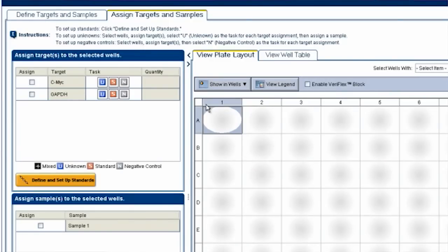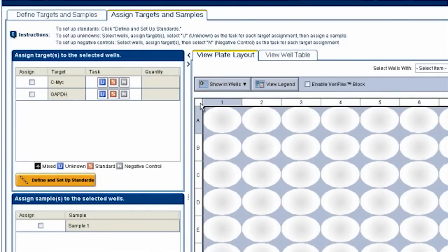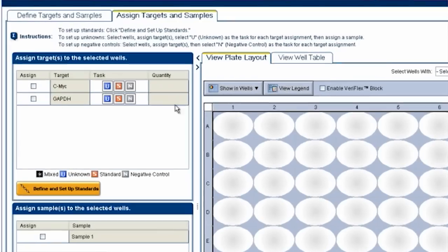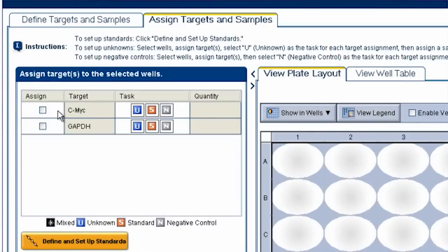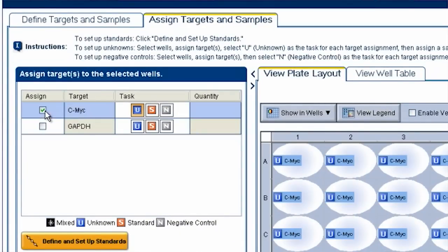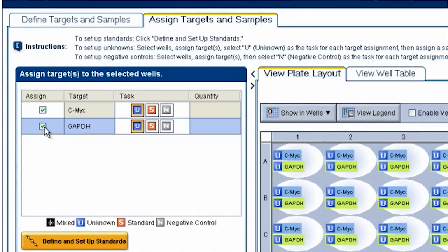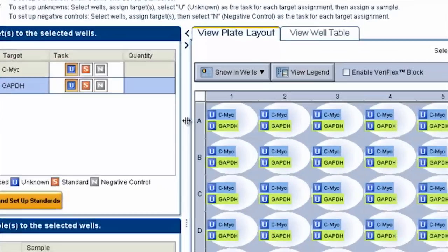To set up a plate of multiplexing in any real-time software, just select your wells, then go to your list of assays and click on both the FAM and VIC targets. Easy.